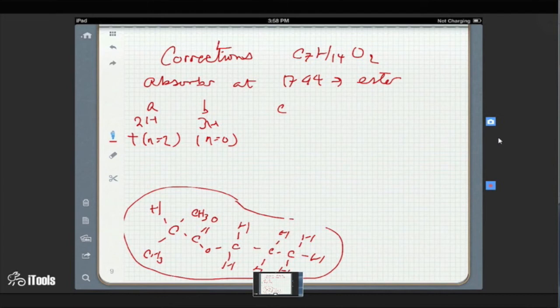So what's the splitting on that CH3 group in the spectrum? The CH3 group on the far right, what's its splitting according to the HNMR spectrum? Singlet, doublet, or triplet? It's a singlet. And does that match your picture? No. All right, so those are 2 good reasons to eliminate that picture. There might be others too.